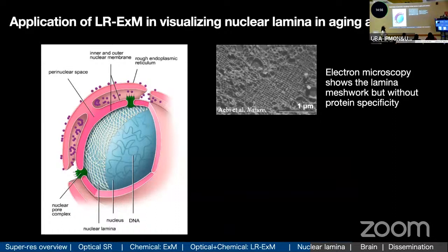And in our lab, we are really interested in the nuclear lamina. One of the reasons is it's quite unique to image the nucleus with expansion microscopy because you'll have the deep imaging power with the resolution, which you don't usually achieve with STORM or PALM. So here we focus on the nuclear lamina, which is a meshwork I explained, and this is what they look like with the electron microscopy.